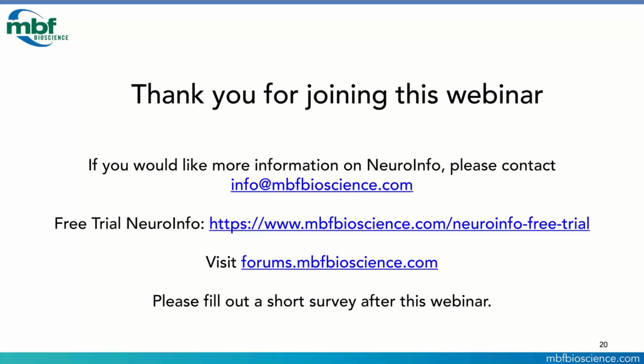Another question I have here is what kind of hardware, software setups are recommended, if any? The minimum specs are at our NeuroInfo website. But the other thing I'd say with that is, I'll tell you the rig I'm using here at home. I have an MSI laptop with an i7. It has 16 gig of RAM and an NVIDIA GeForce RTX 2060 card with 6 gigabytes of RAM.